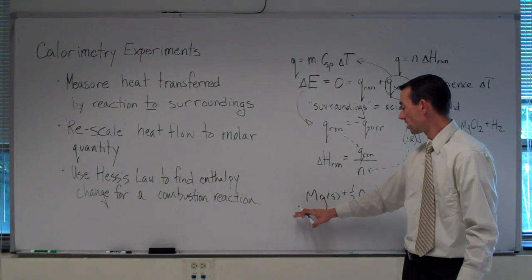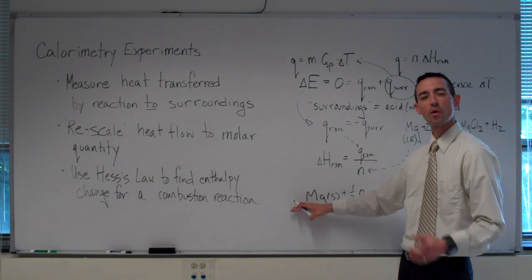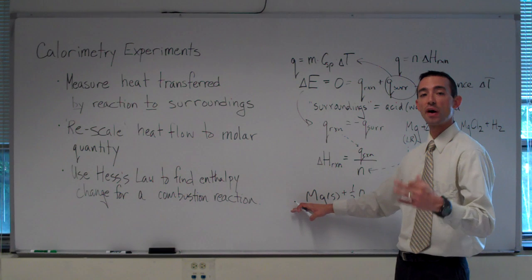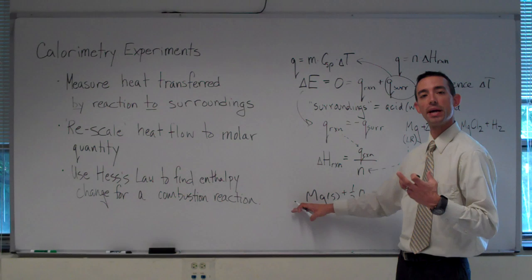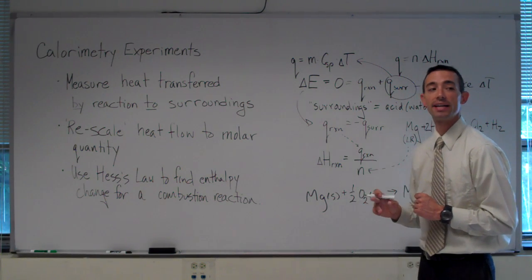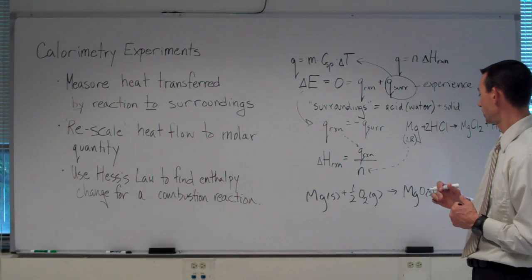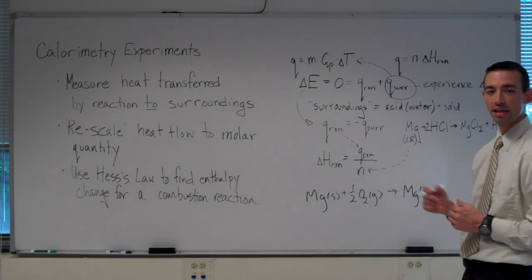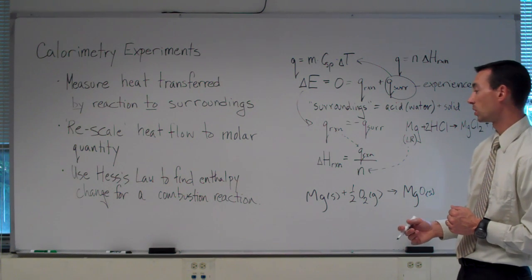Magnesium is actually often part of fireworks. It produces a very white color when it burns, so most likely at any fireworks display, the white color in the fireworks themselves is coming from magnesium metal included in the firework that's being launched off. A little side note for you. So we can't study that in our little calorimeter because it would probably be enough energy to melt the calorimeter, even on a small scale.